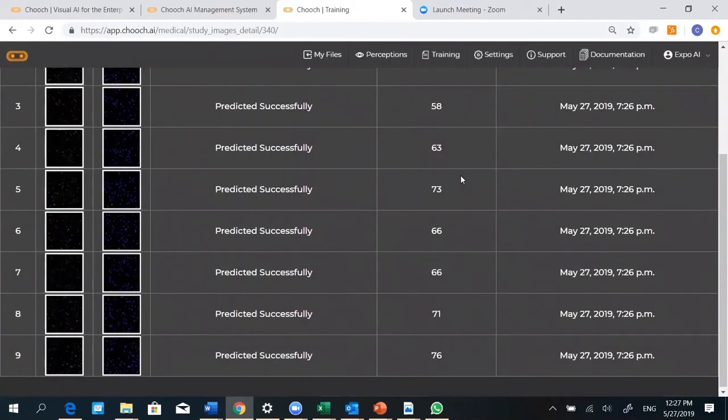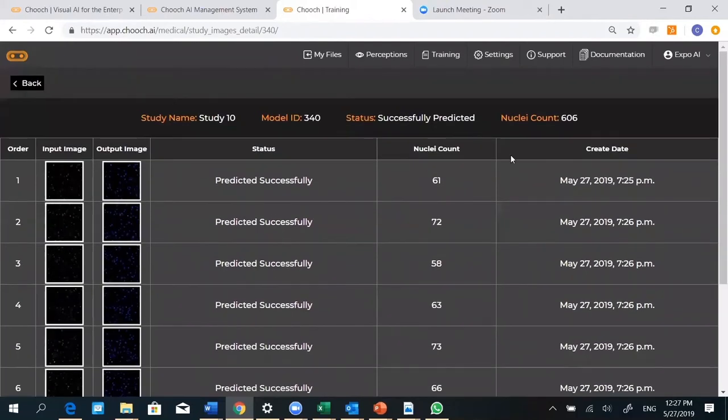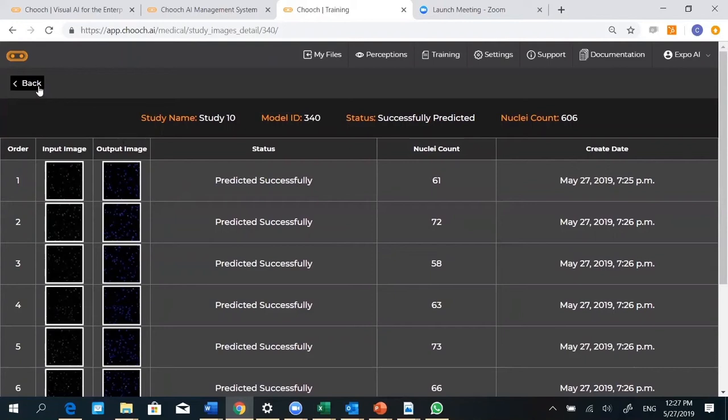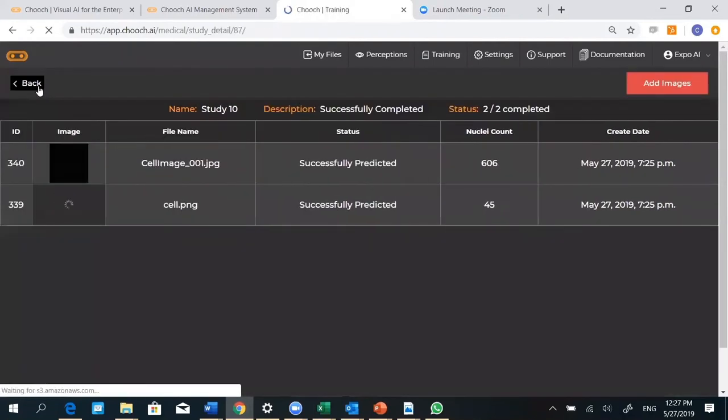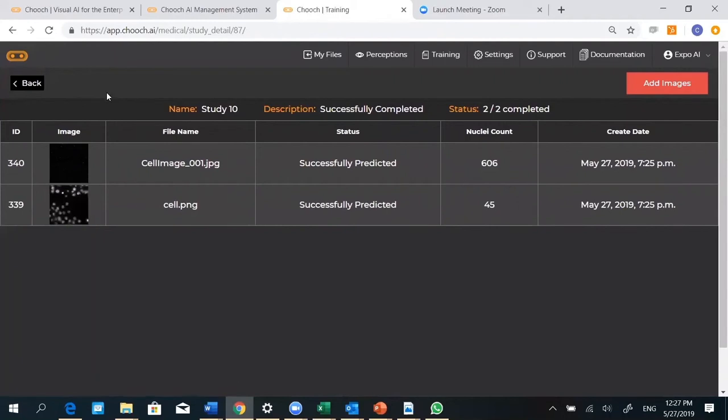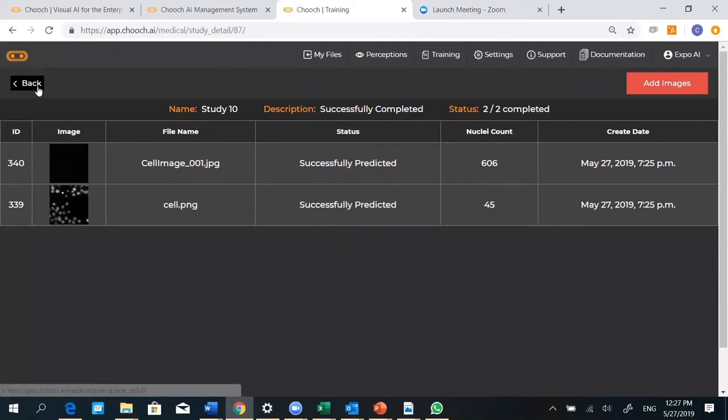It adds it, tallies them up, and here you have 606 in that particular microscopic image. So this is the Nuclei Detection and Nuclei Count perception.